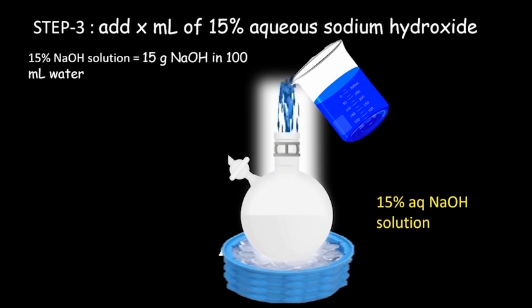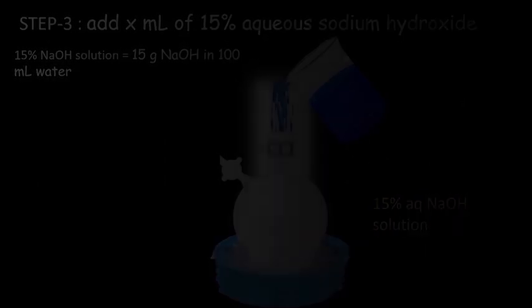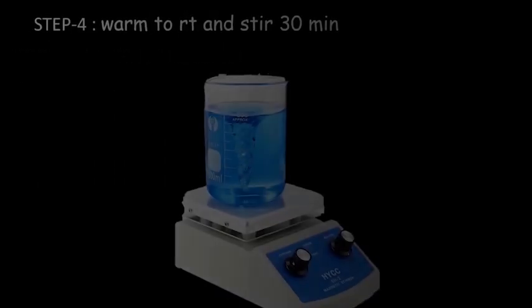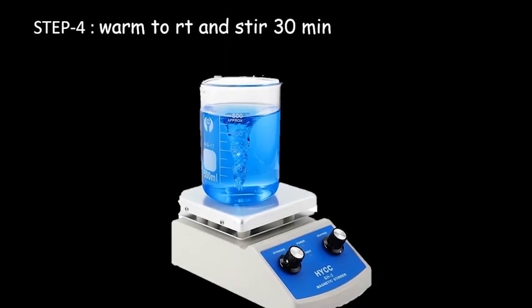Then add again 3x ml of water, which means 3 ml of water, and then warm to room temperature and stir it for 30 minutes.